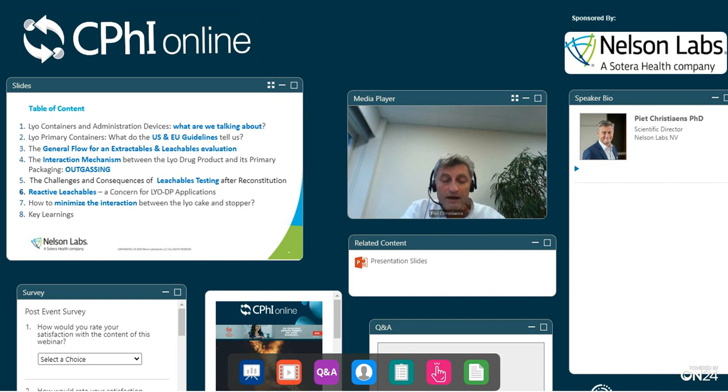In part 3, we will have a look at the general flow of an extractable and leachable evaluation, more in general terms, when you are looking at the pharmaceutical primary packaging in combination with a drug product. Part 4 will go a little bit deeper into the interaction mechanism between the lyophilized drug product and the materials of construction of the primary packaging. And I will try to explain that the mechanism of interaction is not based on a solid interaction between the rubber and the lyophilized drug product, but it's more some kind of outgassing mechanism.